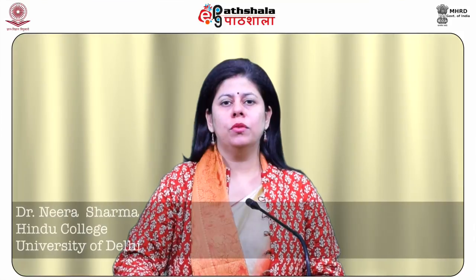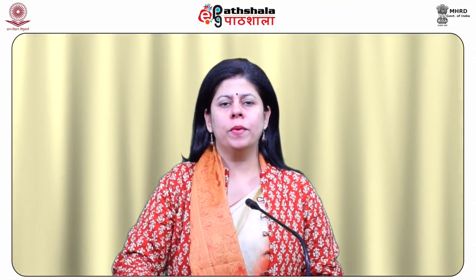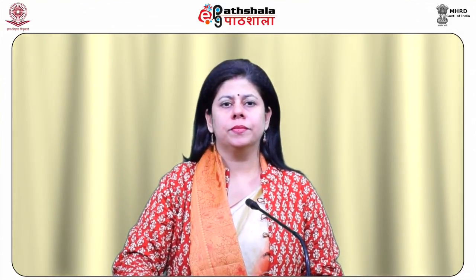After studying this module, you shall be able to know about the significance of Raman spectroscopy, the instrumentation of Raman spectroscopy and its application.